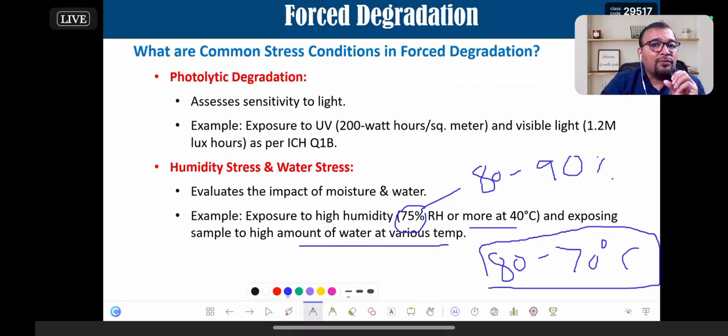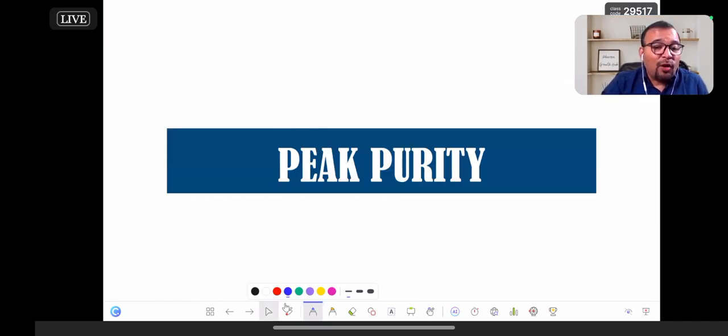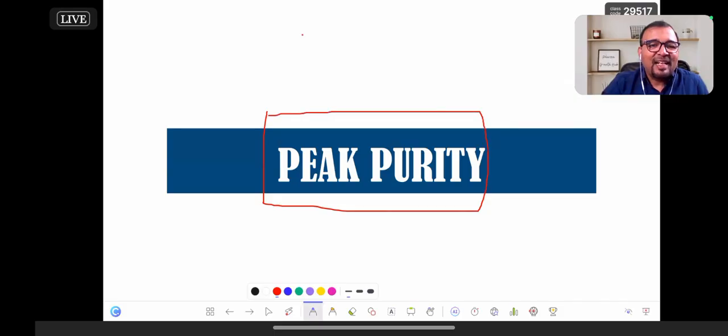So how many conditions have we discussed so far? 6 conditions or 7 conditions maybe. Thank you so much. Shall we go on to the discussion of peak purity now? Type in yes, type in R for ready in the comment box.